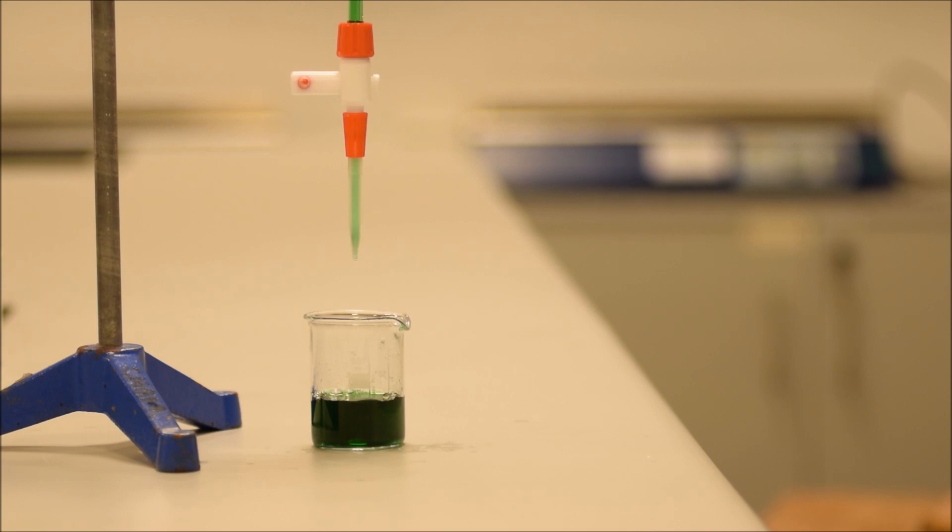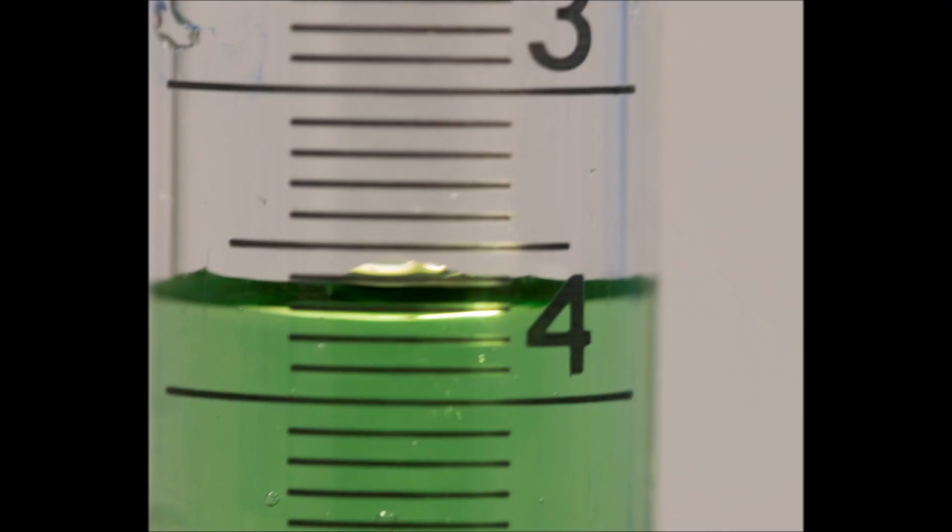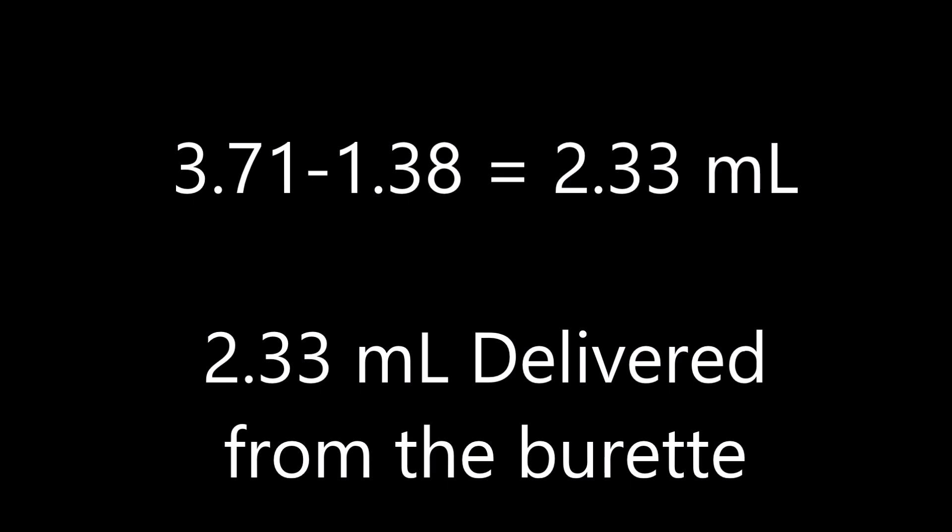So now, in our case, we can re-read the scale, and we can say it's now at 3.71 milliliters. If we take our initial reading away from our final reading, like so, we can see how much has actually come out of the burette. In this case, 2.33 milliliters.